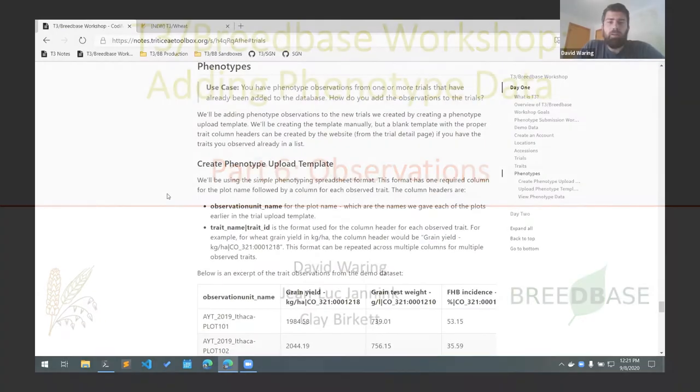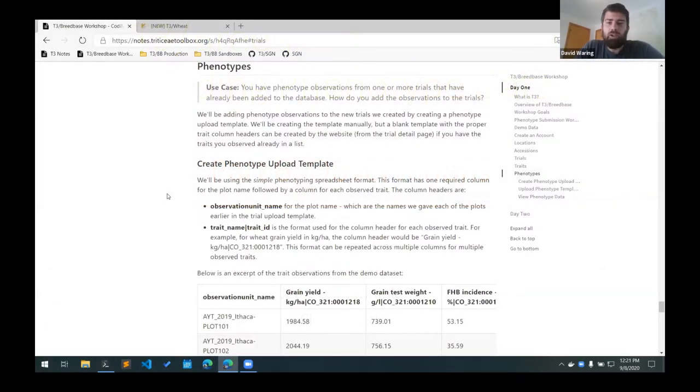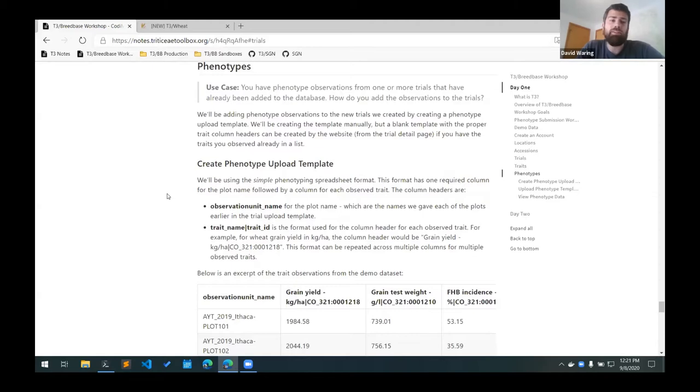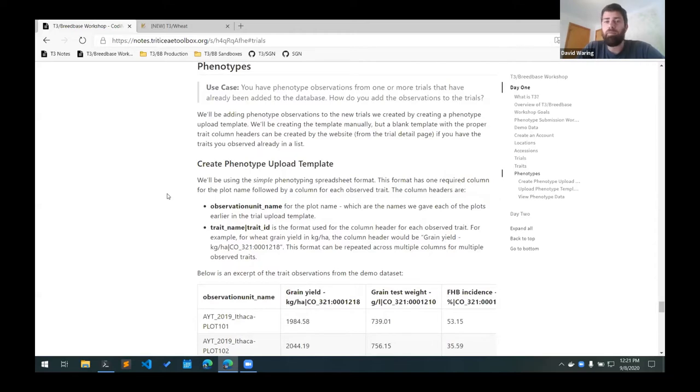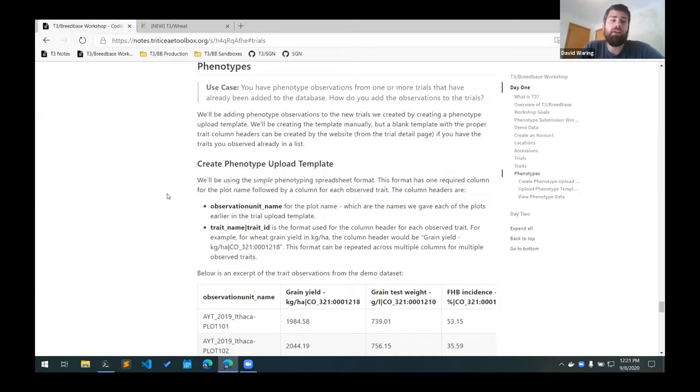Alright, so at this point we have our trials. They're empty so they don't have any observations in them yet. At this point you should have your traits matched up to the breed-based traits and now we can upload the actual observations that we have from the trials.